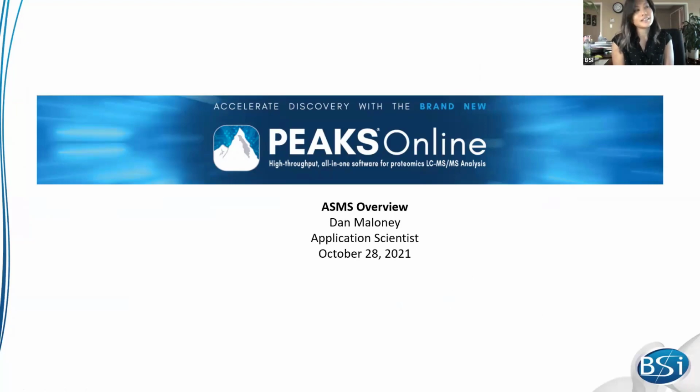involved in starch synthesis. Today, though, as you can see from the slide, Dan's going to be giving us an overview of Peaks Online, which is a high throughput solution for data analysis. It's been growing a lot in popularity, especially with the increasing file sizes of mass spec data today. So Dan, over to you.